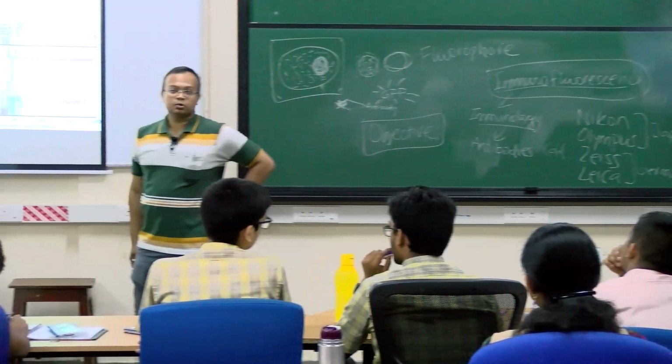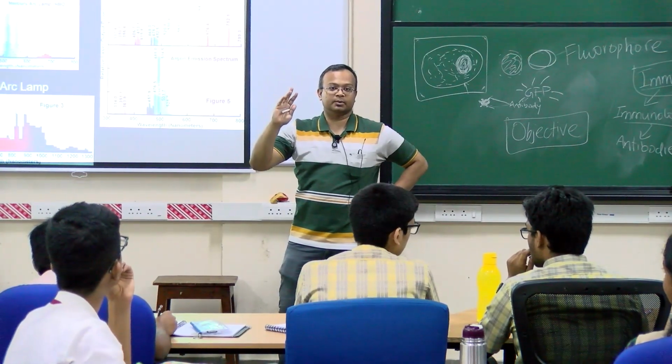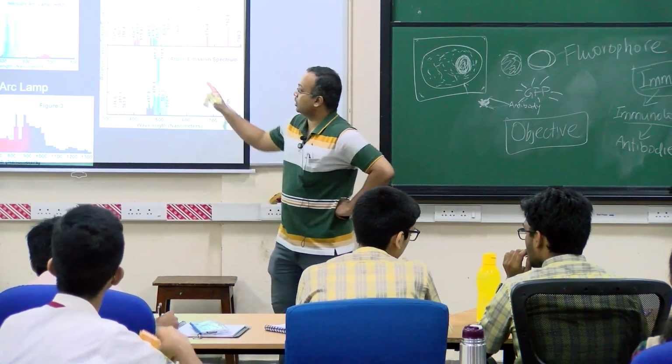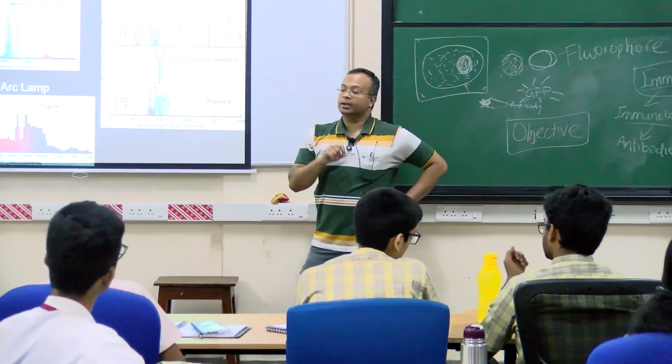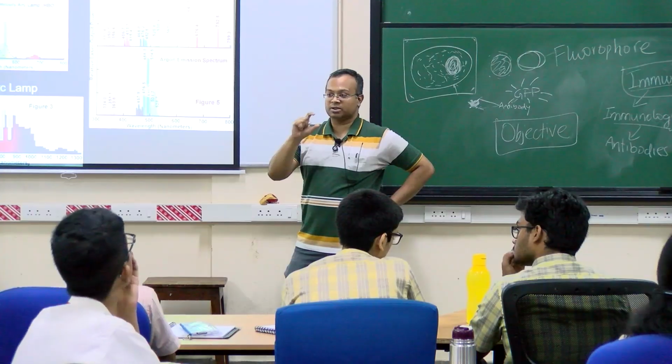frequency. The light that you are seeing has many different kinds of frequencies, but lasers come in one particular frequency. Lasers also have much more penetration, and so with laser light you can image much better.